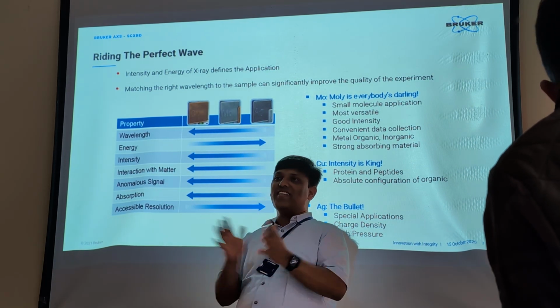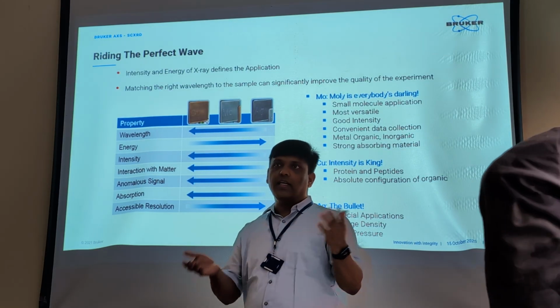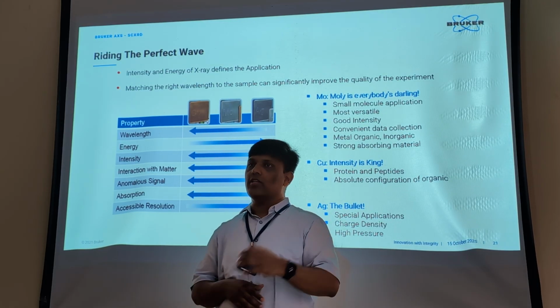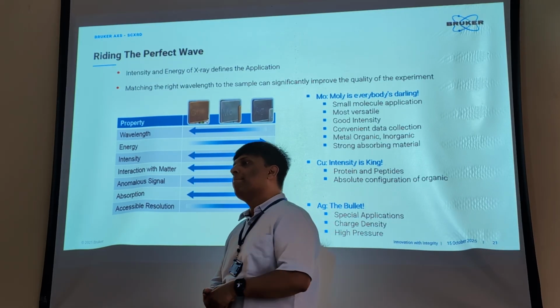Okay. So if somebody grows and gives me, and we can test it. Okay. So whatever. Or I think I'm supposed to come in after maybe 6 months one more time. So maybe at that time, if you are prepared with some sample, we can also test it more. Okay. Sometimes protein makes some kind of crystals when you store it.